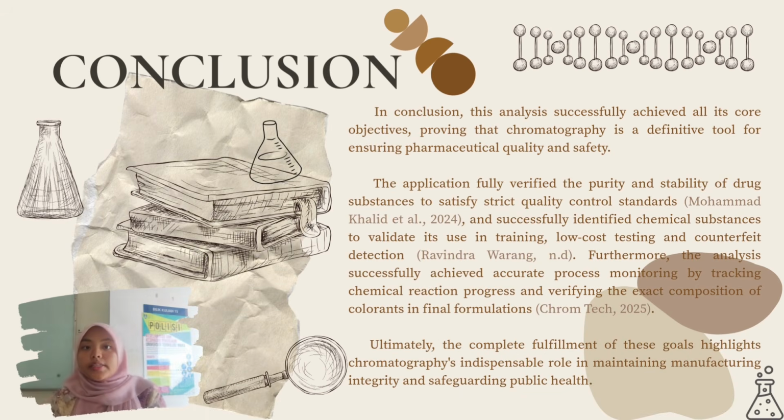In conclusion, this analysis successfully achieved all its core objectives, proving that chromatography is a definitive tool for ensuring pharmaceutical quality and safety. The application fully verified the purity and stability of drug substances to satisfy strict quality control standards and successfully identified chemical substances to validate their use in training, low-cost testing, and counterfeit detection.